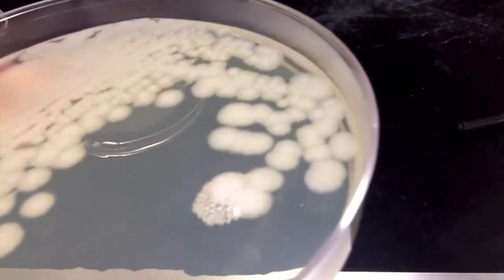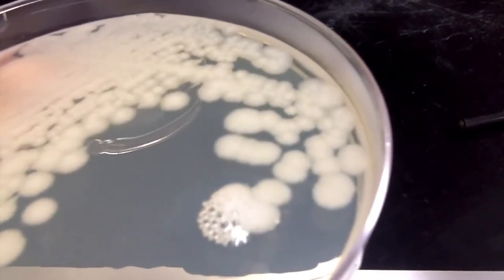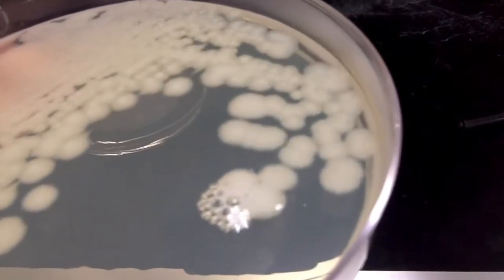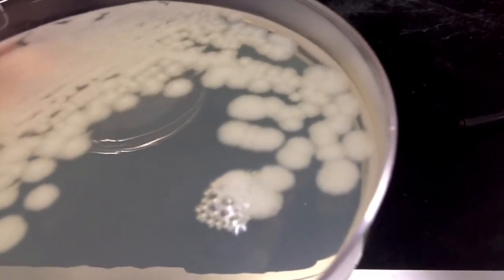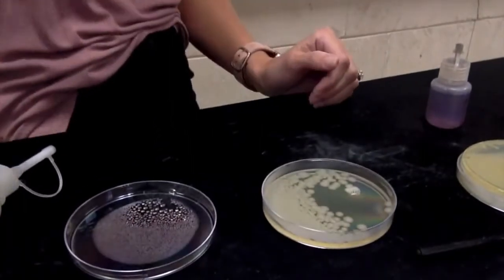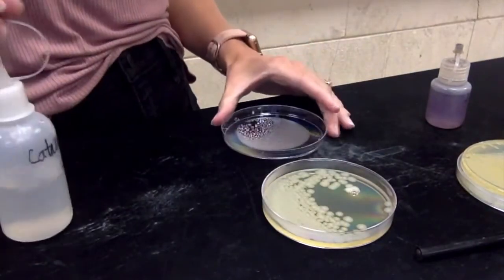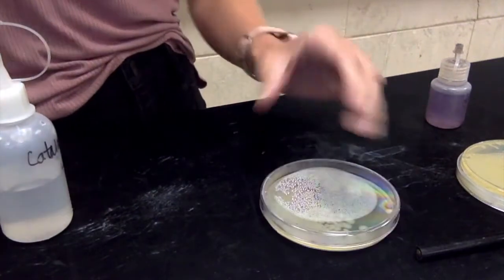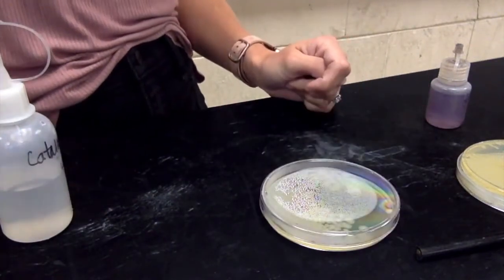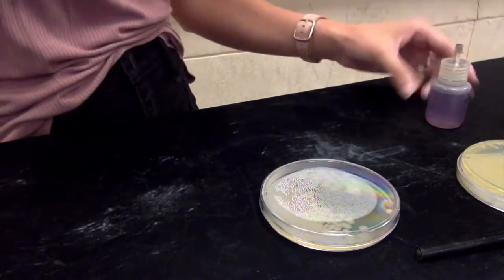Woo, look at all those bubbles. Alright, so that means that Bacillus is positive for catalase. If you didn't get any bubbles, then that would be a negative reaction for catalase. Pretty simple, right? So bubbles, positive for catalase, no bubbles, negative for catalase. And remember what that catalase is doing.